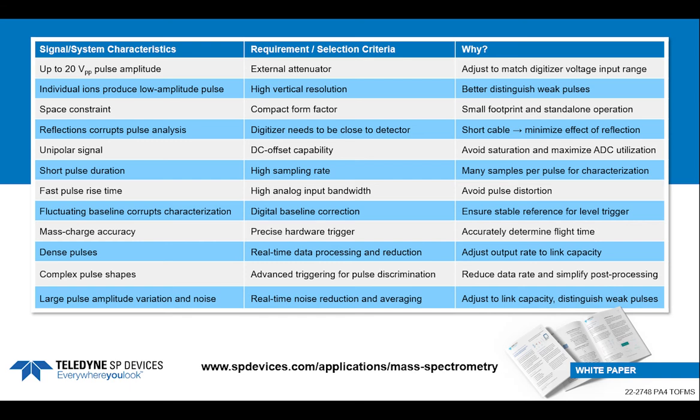This table highlights the key digitizer features required for high-ion mass accuracy and resolution in mass spectrometry.